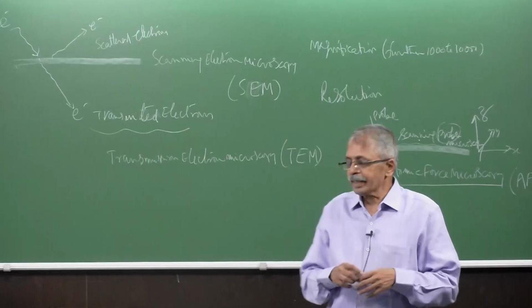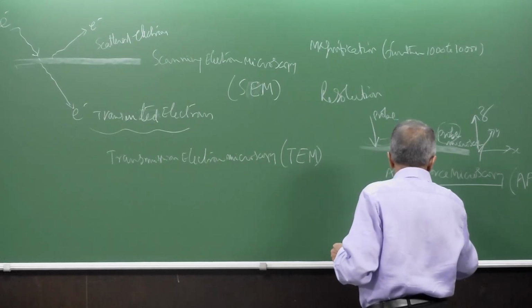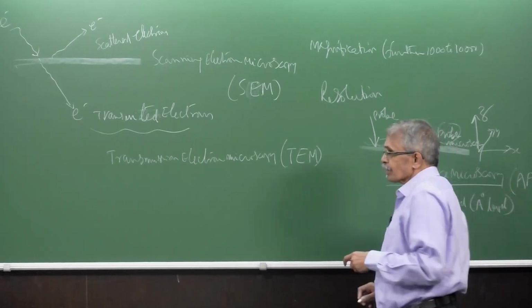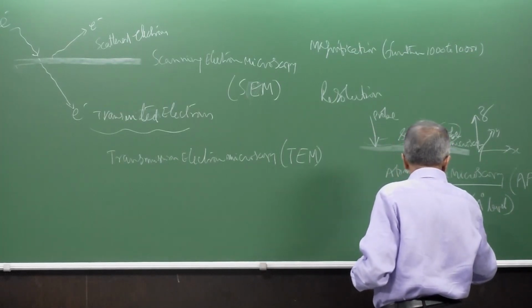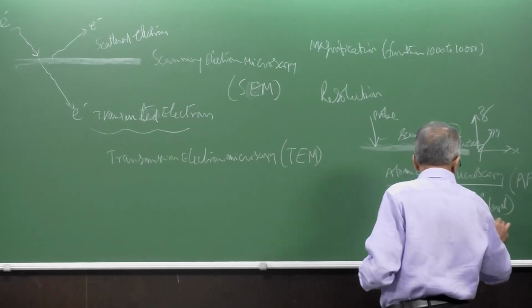So with this you can get a resolution of atomic level, or angstrom level resolutions, and you can get much greater than 1,000 times more magnification than the optical.